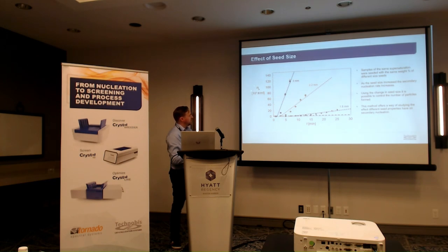And then they took seeding with material with a single crystal and calculated the suspension density against time, and now it changes. Because it's the same supersaturation, just seeding with different size crystals. With small crystals, you have a very low secondary nucleation rate. As you got larger, the secondary nucleation rate increased greatly. And using this sort of information, you're then able to control the level of secondary nucleation.